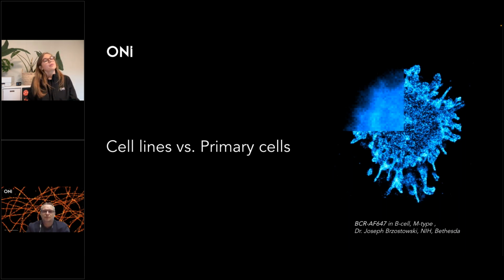So if I'm hearing correctly, it's more important to watch out for the fluorophore? Yes, exactly, the fluorophore. In single molecule microscopy, you need to switch this fluorophore on and off by using high laser powers, and not each fluorophore will actually switch on and off. You most probably have the experience in confocal that when you increase the laser power, suddenly everything bleaches. This is exactly what you would like to avoid.